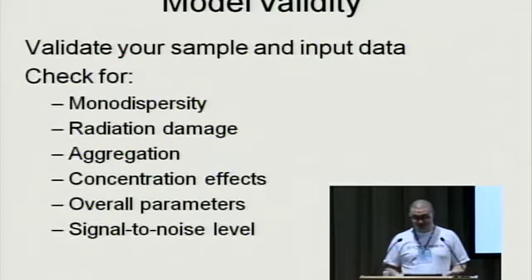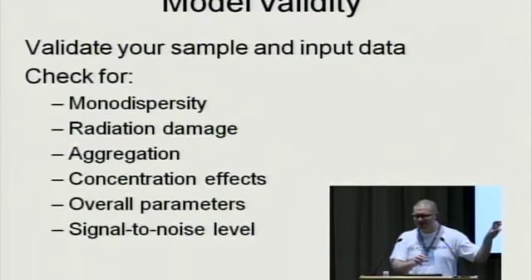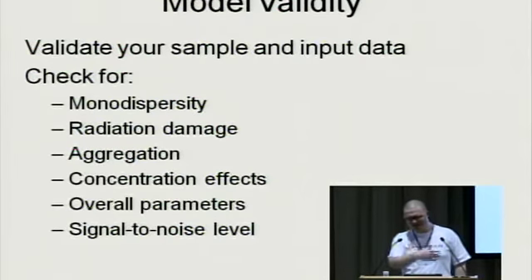With this noise, it was actually possible to create a model that would fit that noise. Noise is very easy to fit, you know. And it actually resulted in an ab initio model. And the users were looking at this model and saying, oh, look, you can actually see this domain that is separated from that domain. And the beamline scientist coming back from the hatch said, no, you cannot. You didn't even expose your sample to X-rays.